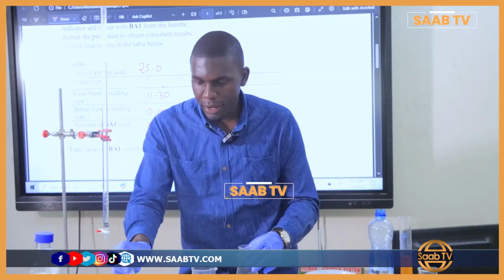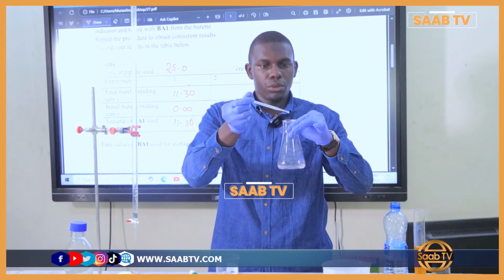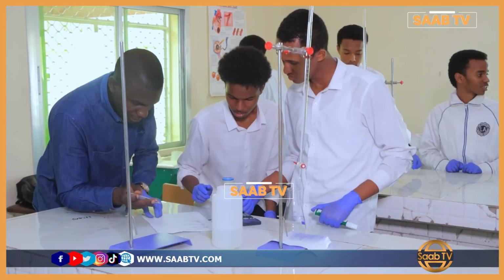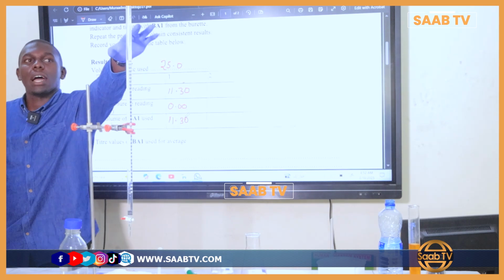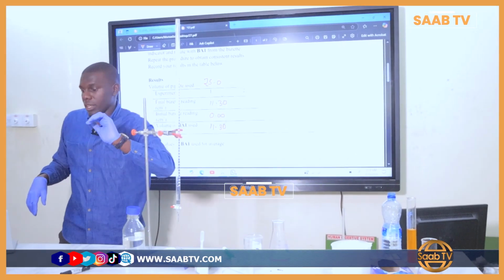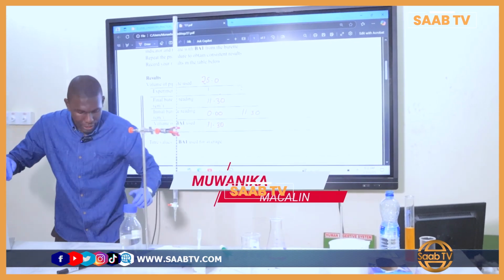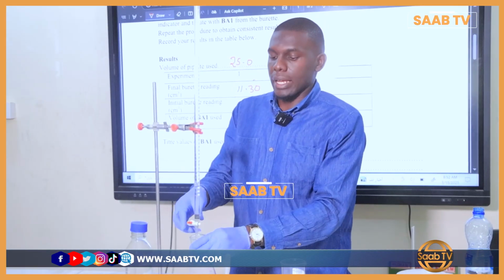So after preparing 25, again we add 2 to 3 drops of the indicator. 1, 2, 3. So we are going to begin the titration again. What is our initial volume we are going to use in this case? 11.30, that's where I'm going to begin from. However, you can even refill and begin from 0 again if you want. Is that clear? But according to this one, I'll begin from 11.30. That will be my initial reading. Then the final reading, I'm going to get it after the titration.